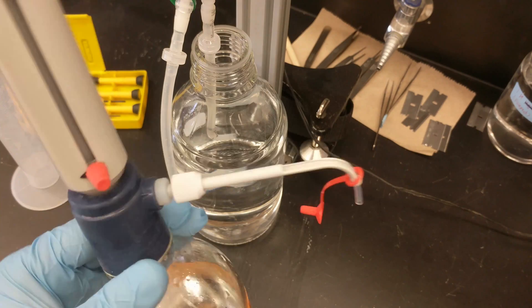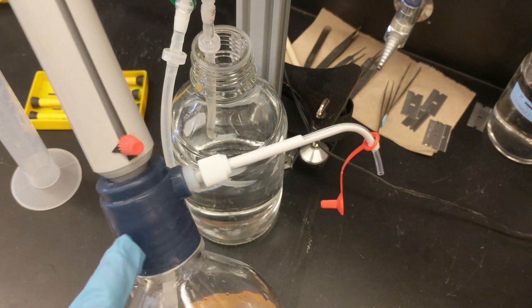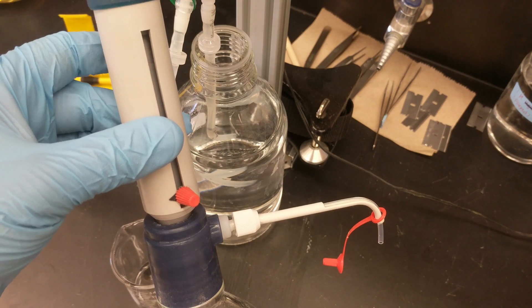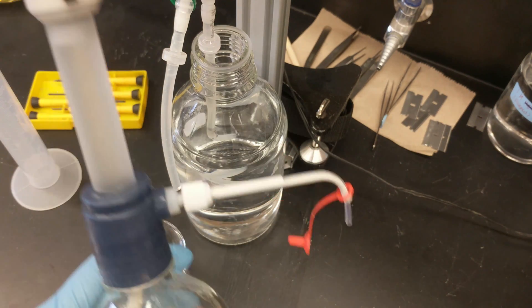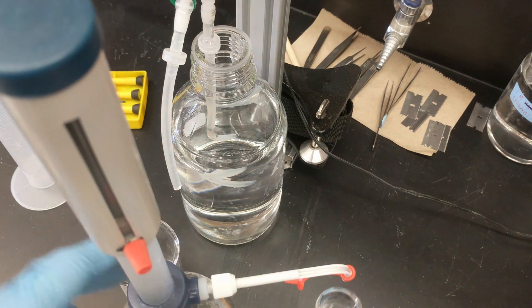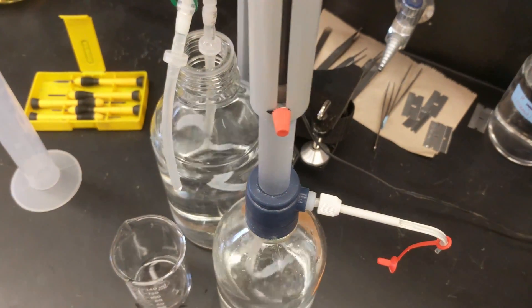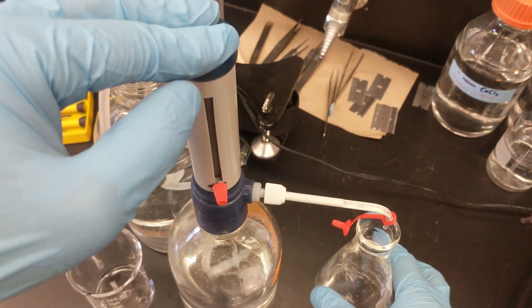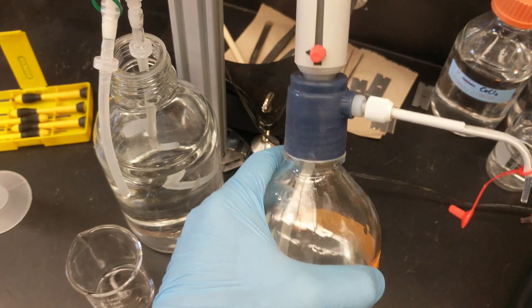But what it is essentially is a glass cylinder in here like a syringe and some check valves that when you raise this specific part, you see that it actually sucks up liquid here. There's a stop there that tells it how far to go up, and then when you press down again you get a specified amount of liquid out from the nozzle, which is all well and good.